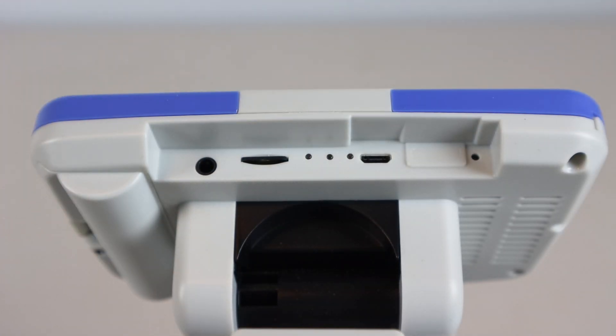Once inserted, push down on the card and it should click into place. This is an empty port and not used. The hole to the far right is the reset pinhole.